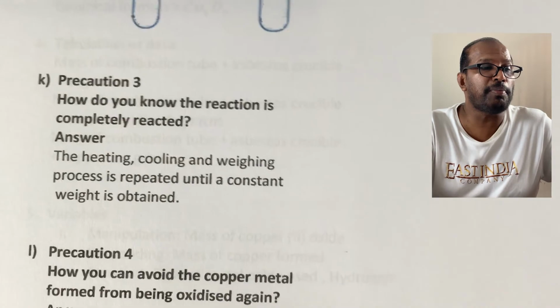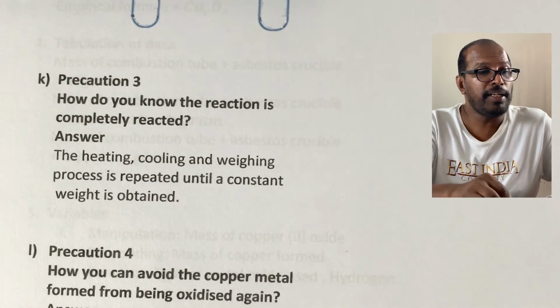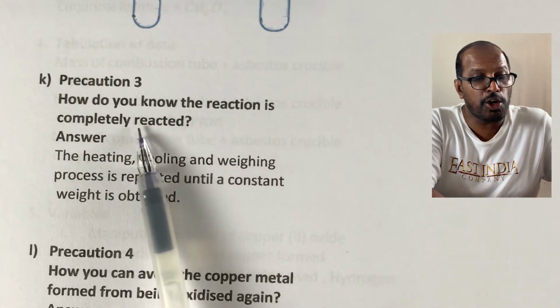Now, the other precaution that you need to look into is precaution number 3, while carrying out the experiment: how do you know that the reaction is completely finished?